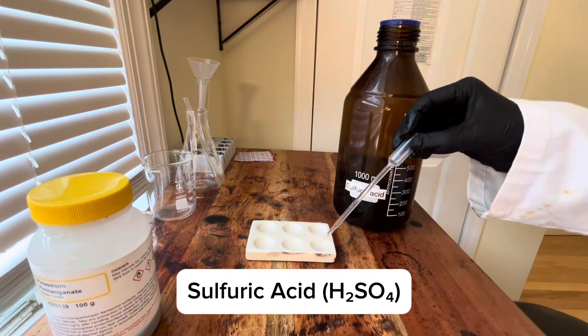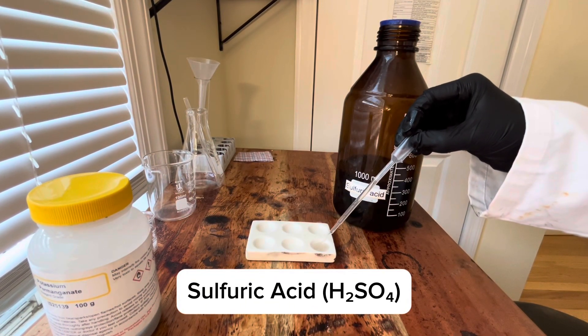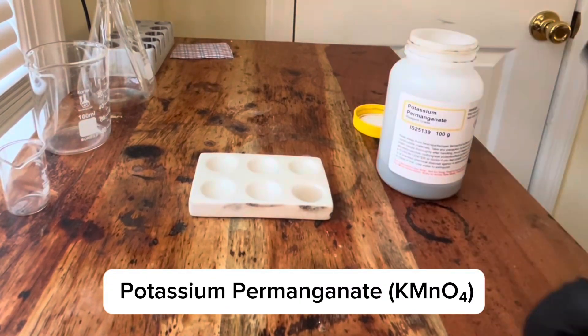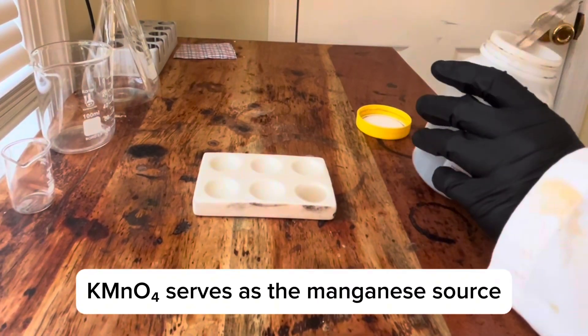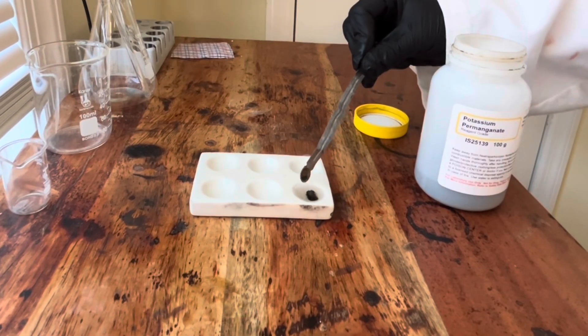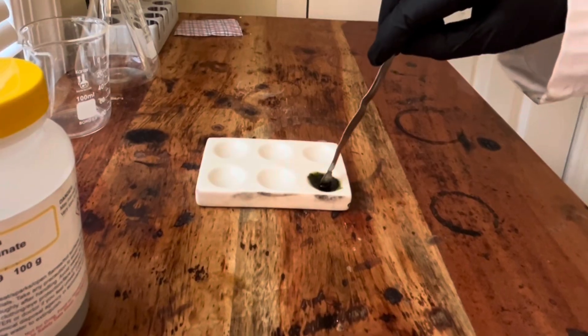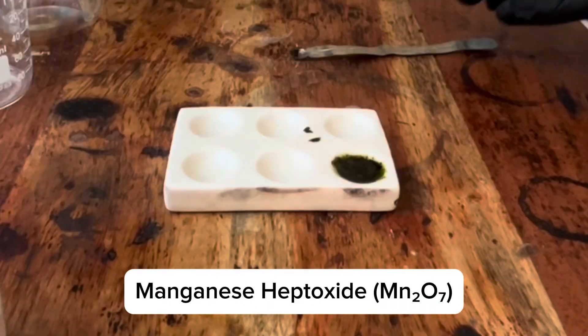First I'm adding concentrated sulfuric acid to my reaction plate. Next I'm adding potassium permanganate, a deep purple powder. What forms is an oily dark green liquid, which is manganese heptoxide.